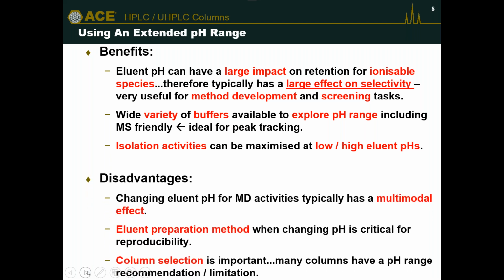It's not the easiest of parameters to consider, and that's why it's not the first box on our method development workflow, because it doesn't always have a linear effect on your chromatography. We see many of these method development softwares have parameters to model temperature and gradient.